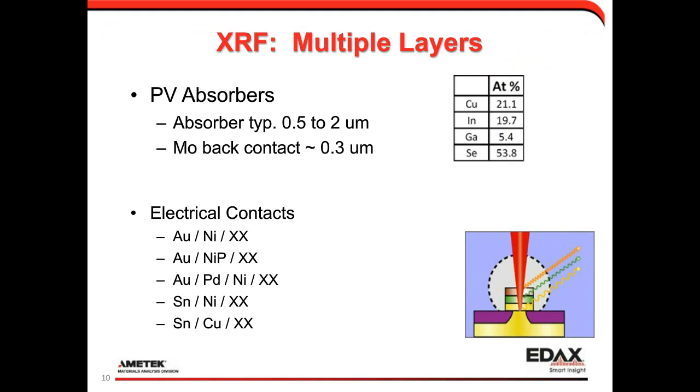Okay. We can also measure multiple layer stacks. This requires a little bit more complicated modeling, and you have to have good control over the accuracy of the top layer, because errors when you calculate for the top layer in the computer modeling percolate down into the lower layers. I just wanted to show here some typical multi-layer stacks that we measure.